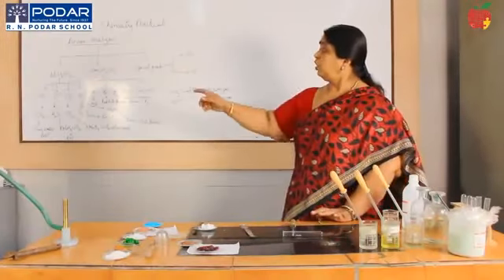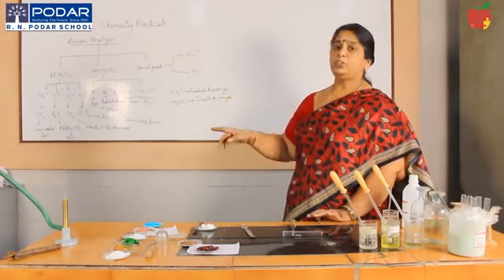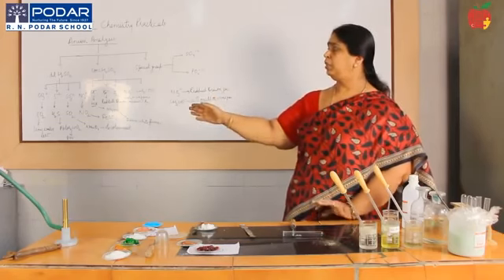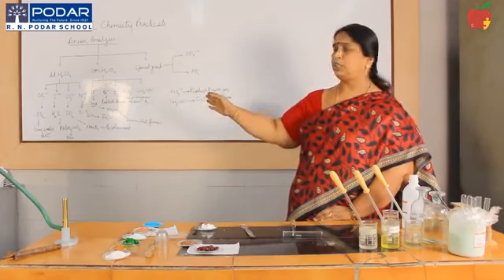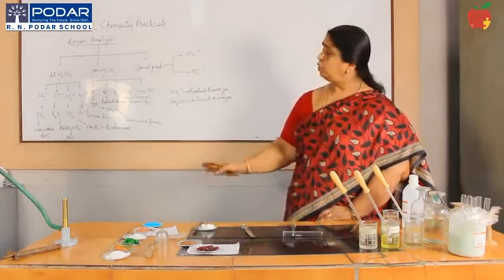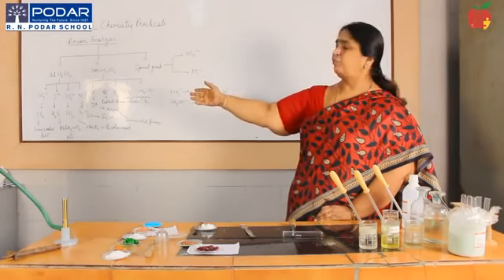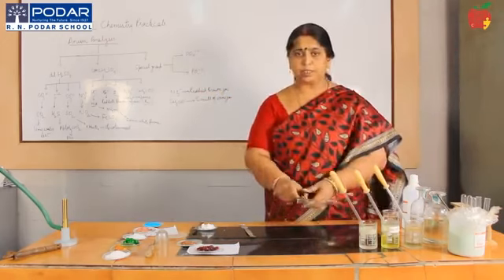Yeah, you saw that ma'am was describing the anion analysis divided into three portions. Some anions can be tested by using dilute sulfuric acid, some by concentrated sulfuric acid, and we have the special group as well. So now I will just perform one or two, for a carbonate and for a nitrate for example, and show how you will analyze. So let me take a carbonate salt.